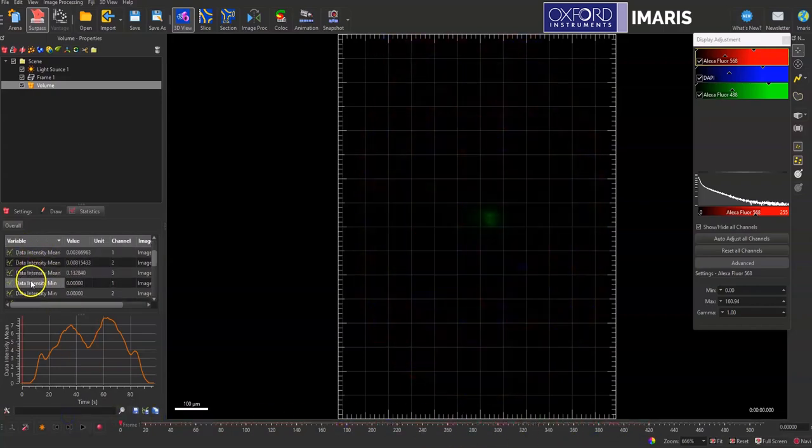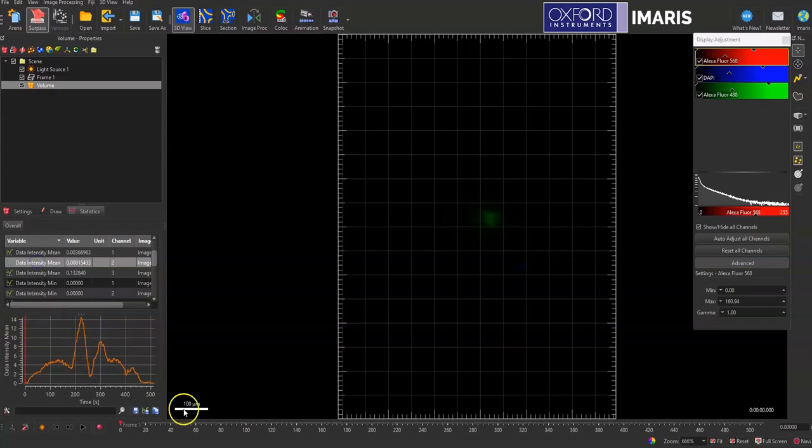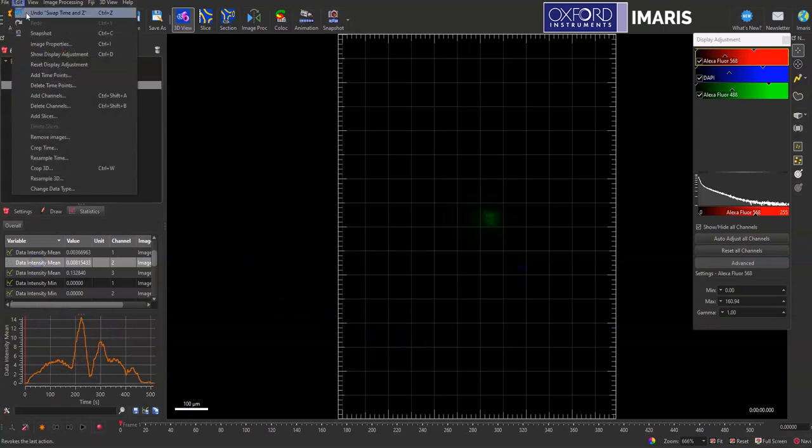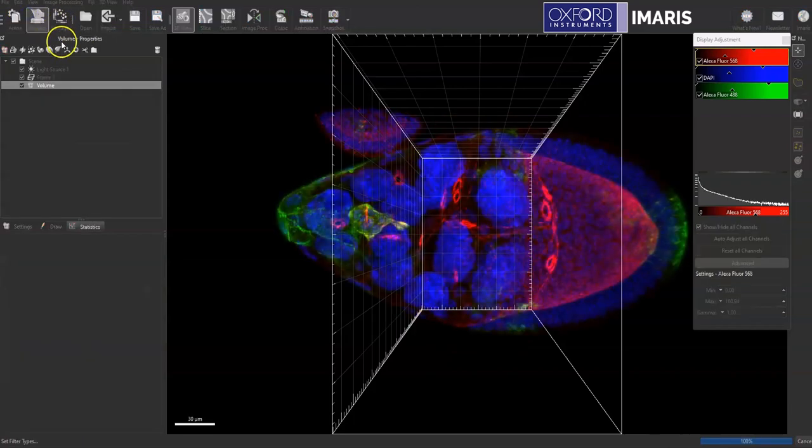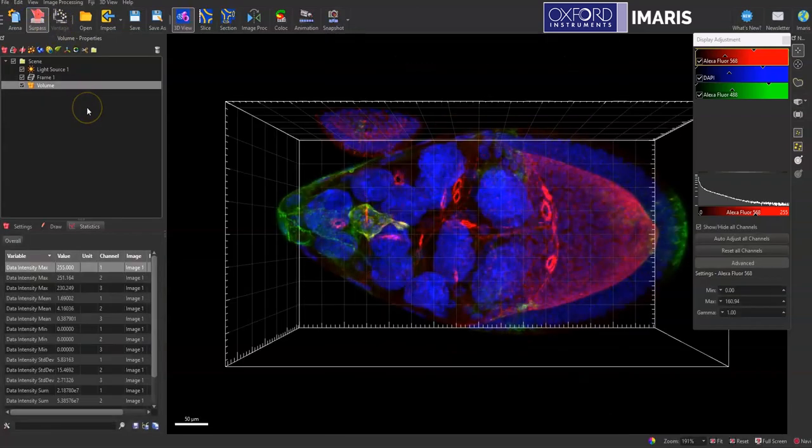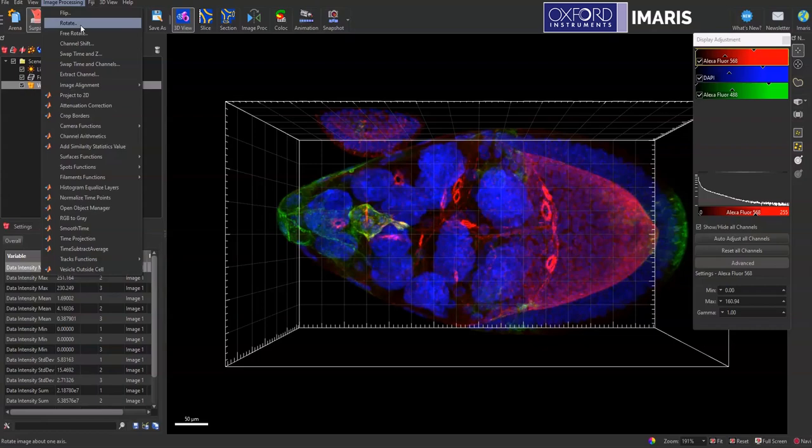If your image isn't perfectly aligned to the different planes you can do free rotate instead of just rotating automatically.